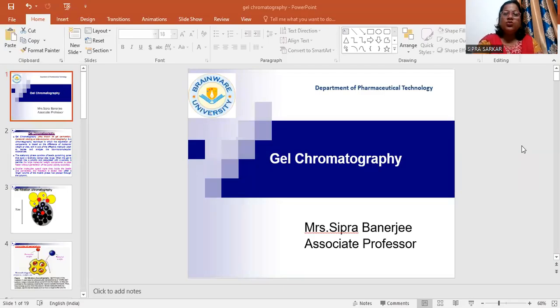Good afternoon, students. Today we will be starting gel chromatography, unit 5 of semester 7. Chromatography, you know very well, is a separation of different molecules according to their affinity and according to the principle of absorption and adsorption. In gel chromatography, gel will be used as a stationary phase, and compounds of different molecular size, especially higher molecular weight, will be separated.